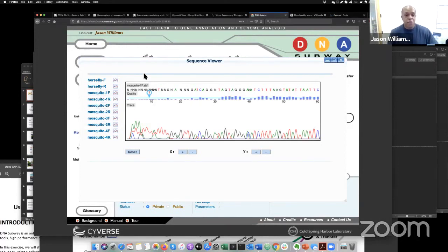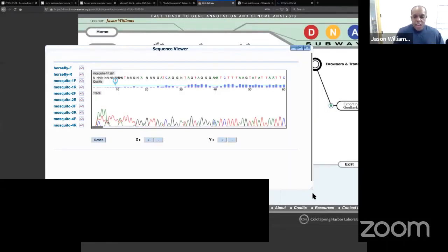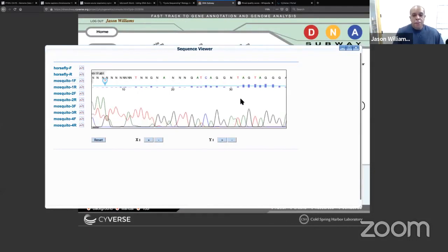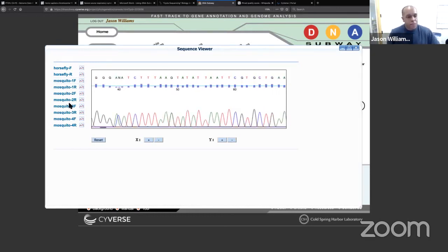As it turns out, and as we'll go through in a little bit more depth next time, we sequence the mosquito DNA twice in order to minimize the chance that we have error. So we sequence it twice, and I'll talk a little bit about bidirectional sequencing. And what that takes care of is even if we have some data that is not the highest quality, if we do it at least twice, then we may be able to recover areas where the computer in one particular case did not come to a determinate conclusion, but in another case, perhaps it did.